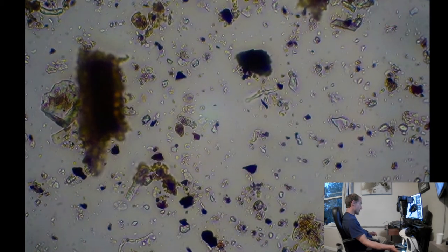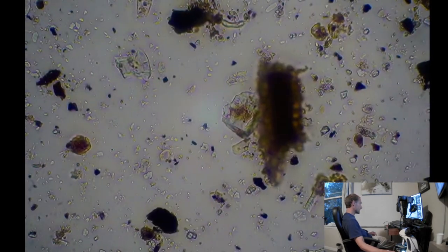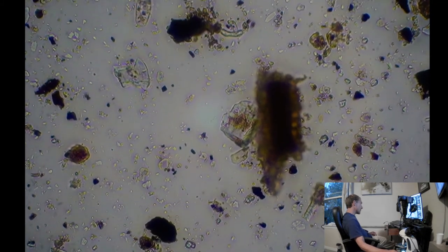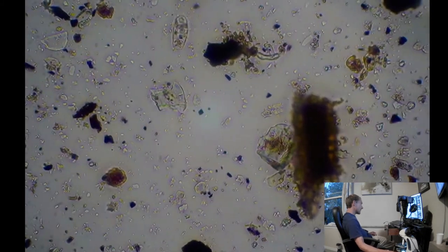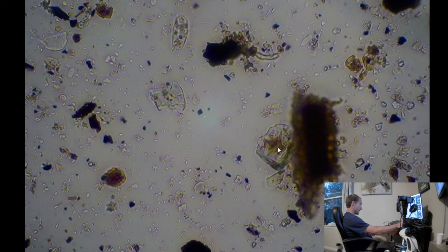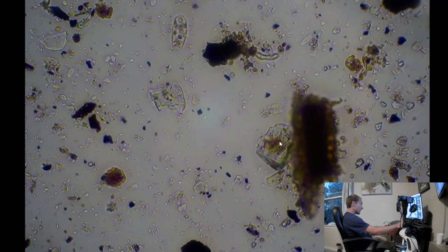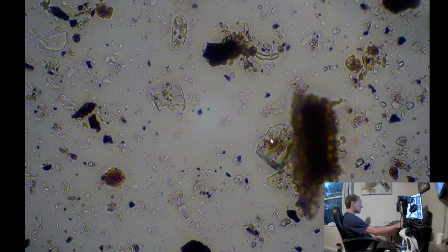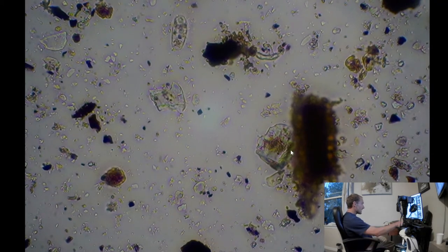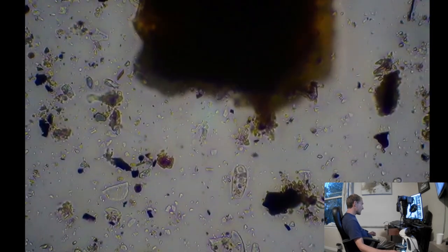Actually, if we put a little bit more shading, we'll get a little bit more detail, show off some cool stuff here. Yeah, see, this was all clear, but now the bacteria are spitting out their glue, which then makes this mineral actually excrete the nutrients that the bacteria want. And it's the glue that kind of holds everything together.